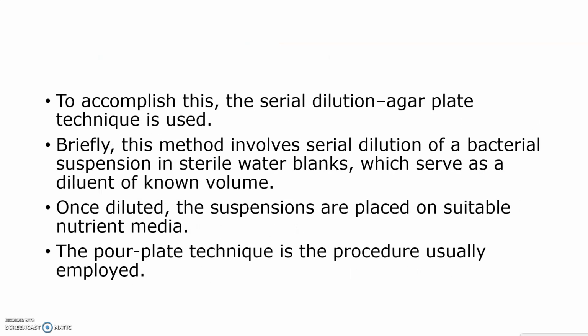So to accomplish this, what are the different techniques we use in our laboratory to separate? A serial dilution agar plate technique is used, and in this session we are discussing the pour plate. In the last session, we discussed the streak plate technique, in which the organism can be isolated into colonies in the agar media. And briefly, I am saying about this method.